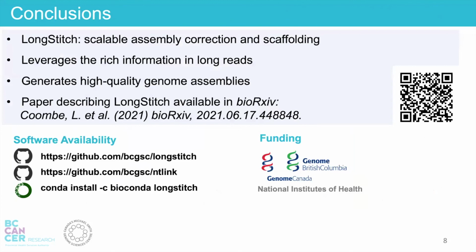Finally, to conclude, LongStitch is a scalable assembly correction and scaffolding utility. It leverages the rich information in long reads to generate high-quality final genome assemblies. If you want more details about LongStitch, we have a paper available on bioRxiv, and our tools are available on GitHub as well as through Bioconda.